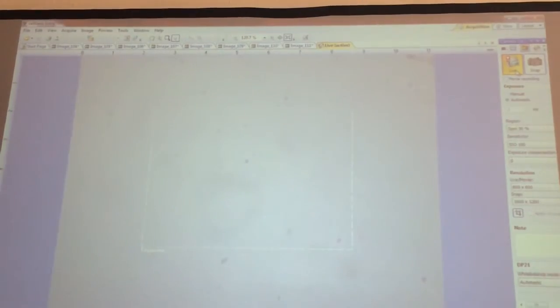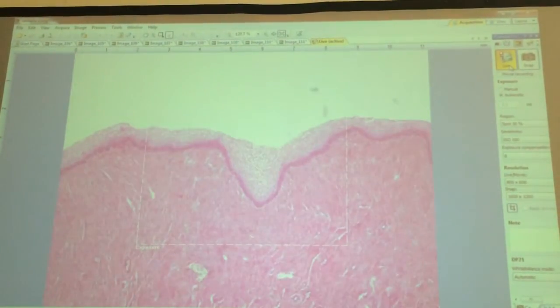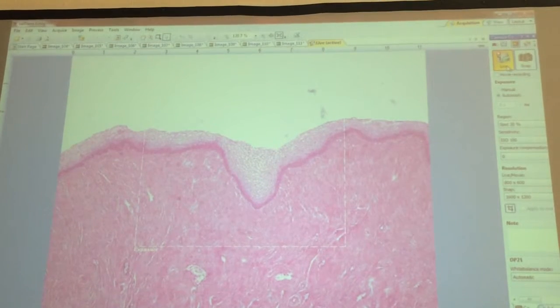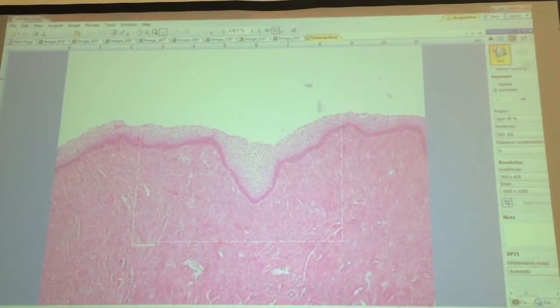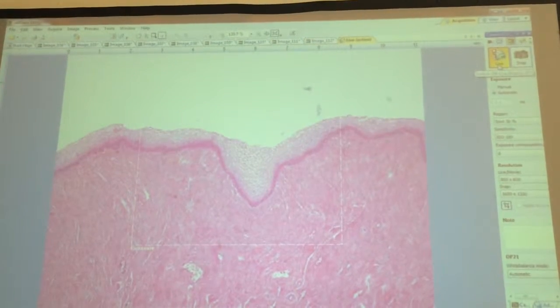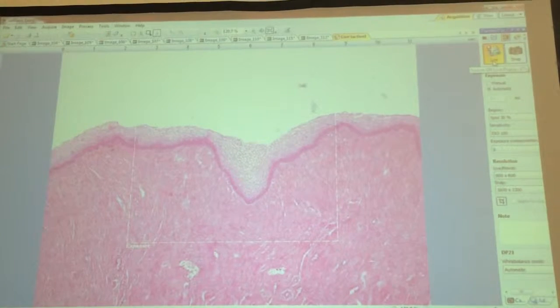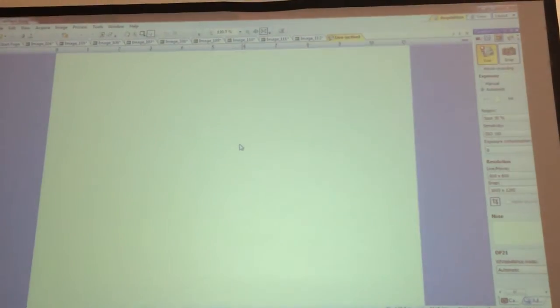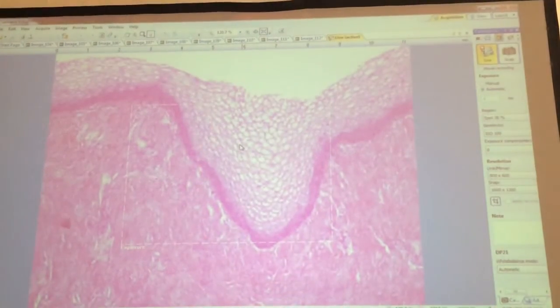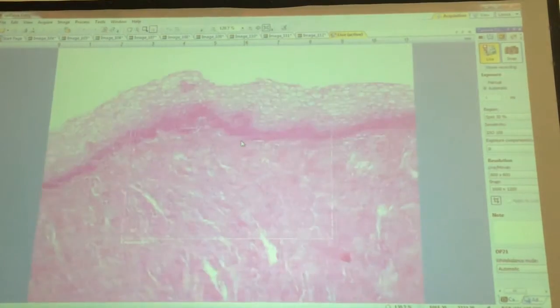If we're looking at the vagina slide, I'm going to go ahead and do these two, so you have them here. Okay, this is the vagina slide. I'll go ahead and snap that picture. To me, this is always a really easy one to identify because it is stratified squamous epithelium. This is great stratified squamous epithelium. If you look at that in a little bit more detail, okay, you've got some good stratified squamous epithelium there.